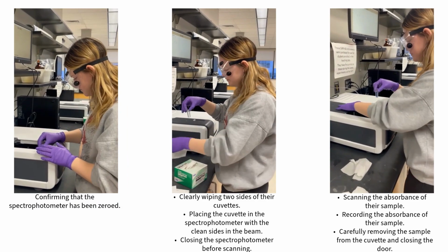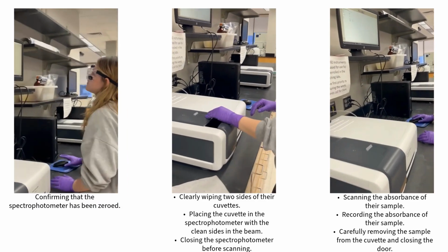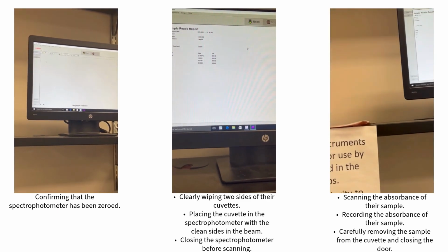When looking at the relationship between absorbance and concentration, we find that as the concentration rises, the more light is absorbed, therefore increasing the absorbance rate.